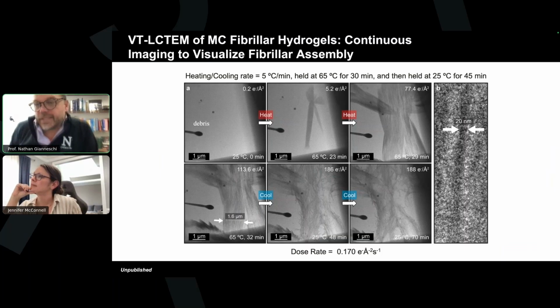The problem is you see nothing detectable. It's not like you start, in this particular case, we don't see clumps and things, although I'm sure many other people have seen that type of thing where there's wisps of the material now floating around randomly. I think in some ways, the long distance order on that micrograph on the top right is a good sign that you probably haven't damaged something. It's hard to accidentally get something like that, and then obviously consistently see it reproducibly. But yeah, the damage manifest in this case is like a dispersed sample, as in invisible.